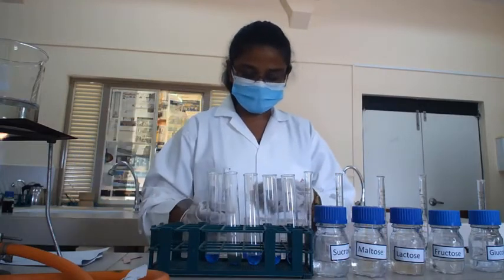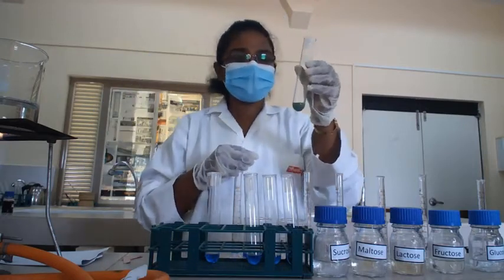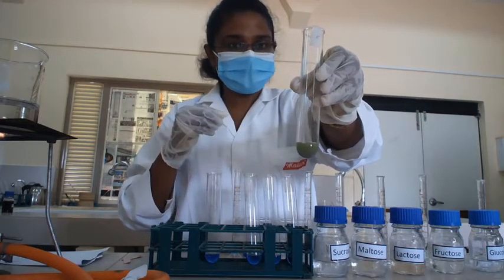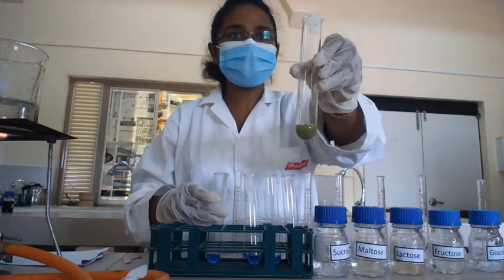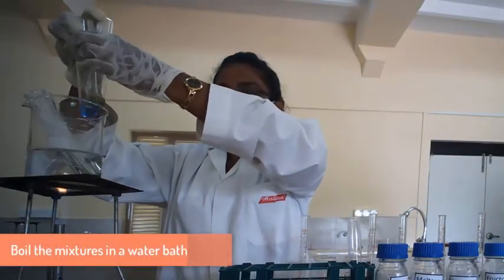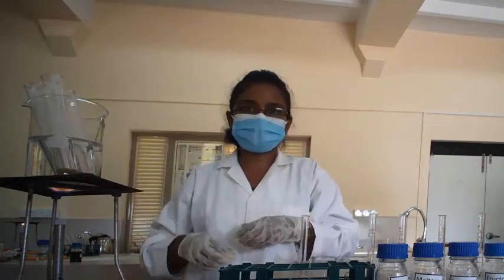Okay, then we are going to put it in the water bath. Before putting it in the water bath, you can see fructose starts to react with the Fehling solution. As you can see, the blue color turns into a mud green color because fructose has a higher reaction rate compared with the other sugar solutions. Now we are going to put these sugar solutions into the water bath. Then we can observe the color change.